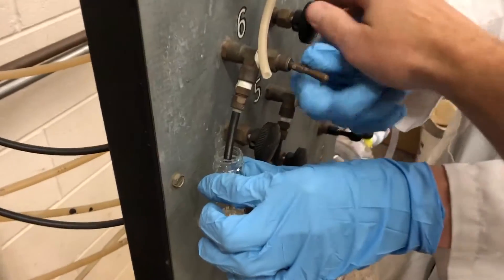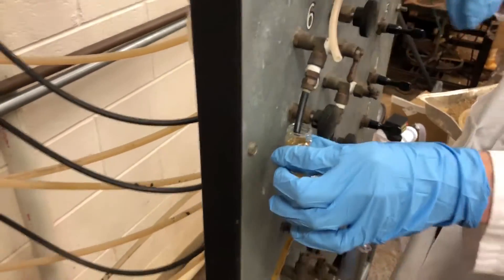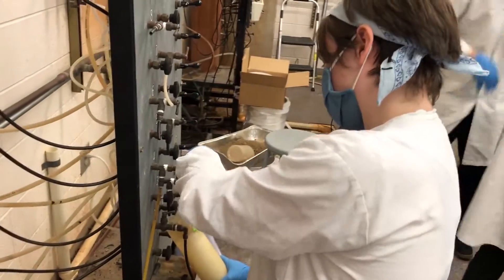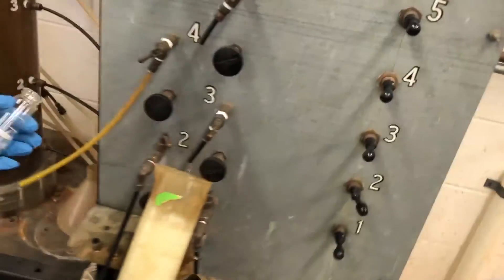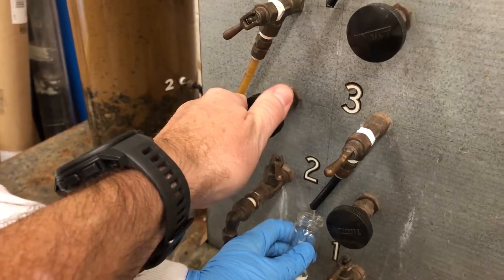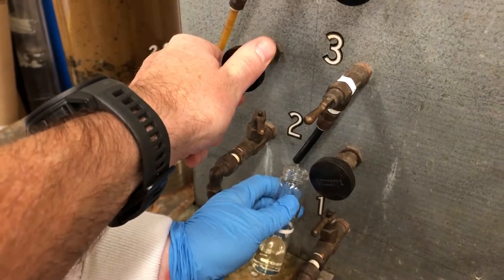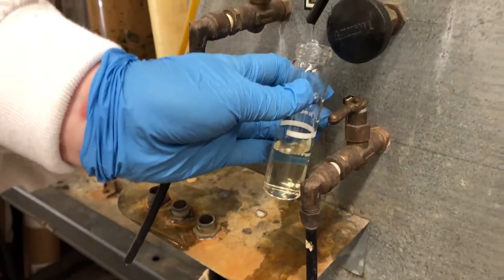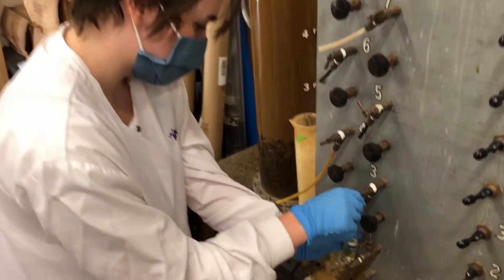Can we increase the flow rate at all? We're deliberately keeping it at a trickle. Taking sample number three — also trickling. Let's pump it up a little bit if we can. Increasing our sampling rate. Number three — we can see it's got some color to it. It's filtering near the bottom, so we don't have too much coming out quite yet.